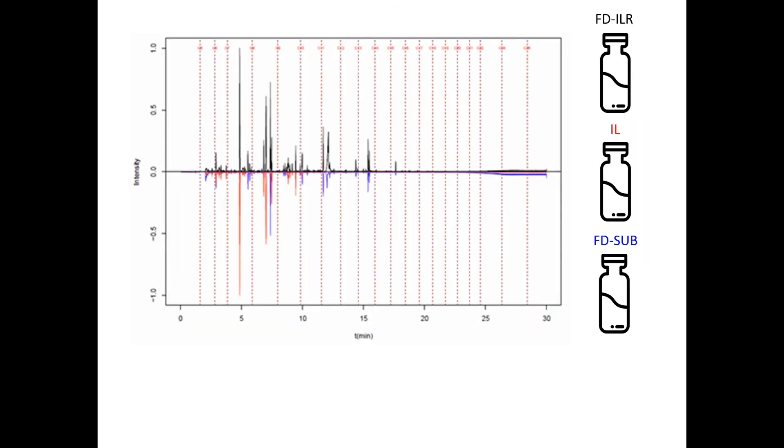The plots demonstrate the contribution of ignitable liquid and substrates in the fire debris sample. The black total ion chromatogram in the upper section is the fire debris sample. The blue total ion chromatogram in the lower section is the substrate or substrates in the fire debris sample. The red total ion chromatogram in the lower section is the ignitable liquid in the fire debris sample.